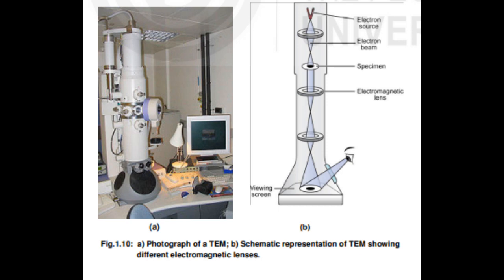The resin gets polymerized, hardened, and the hardened sample is cut into very thin sections using a diamond or glass knife present in the instrument called ultramicrotome. The thin sections are picked up using a boat filled with water, made present around the glass knife. The cut sections float on the surface of water, which are picked up and placed on the surface of a copper grid, Fig.